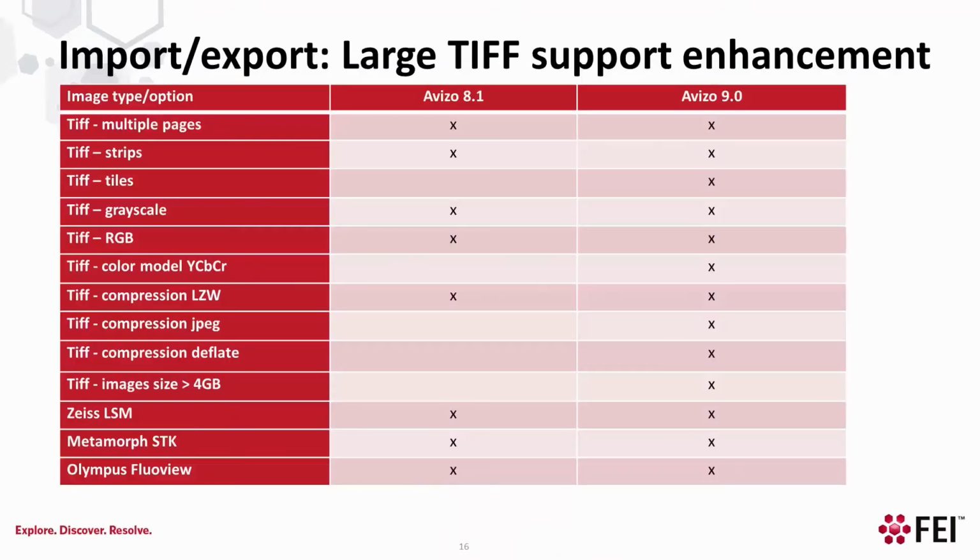Now I would like to go through some of the enhancements and additions we made with this release of Avizo 9, and I would like to start with the new TIFF support that we are adding to Avizo 9, with some enhancement to our ability to read TIFF files. As you can see on this slide, a comparison between Avizo 8.1 and Avizo 9.